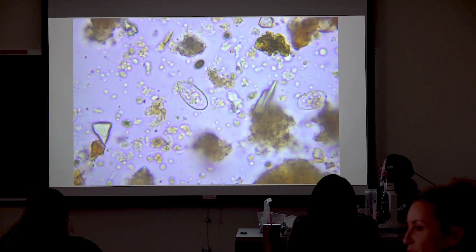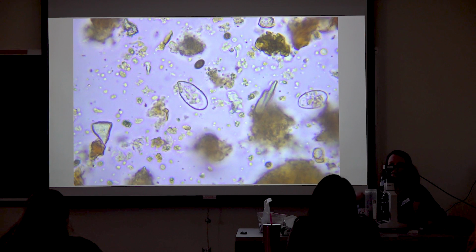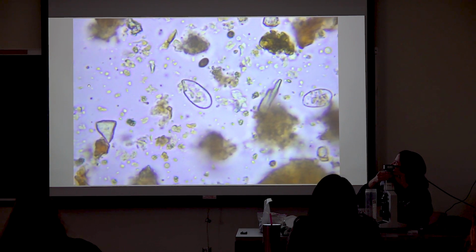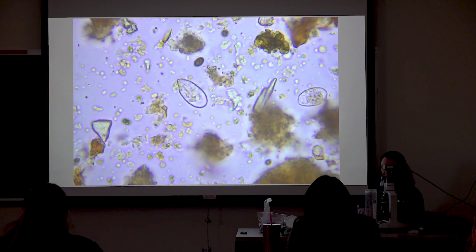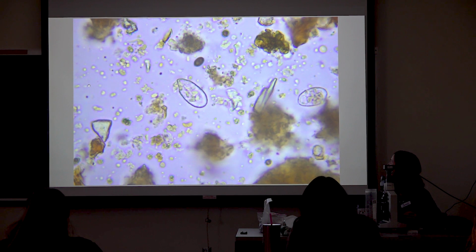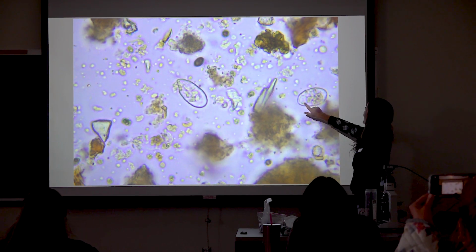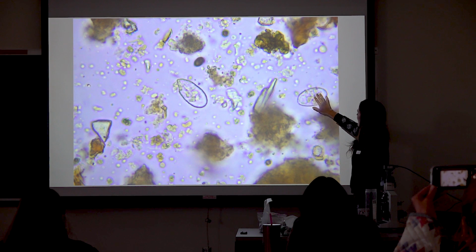Yeah, so this guy, actually both of these guys right here, these are amoebas. Wish I could focus. Yes. Wake them up. So testate amoebas are definitely shy, particularly when I just scooped them into a bottle and shook the crap out of them. But there are certain things that you'll notice that'll help you identify. This kind of teardrop shape is really one of the most common ones that I see. So you'll see they have this hard shell. So this stuff that you're seeing, this kind of blorbly stuff inside, that's the actual amoeba.